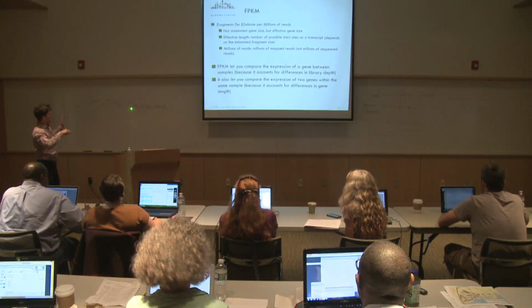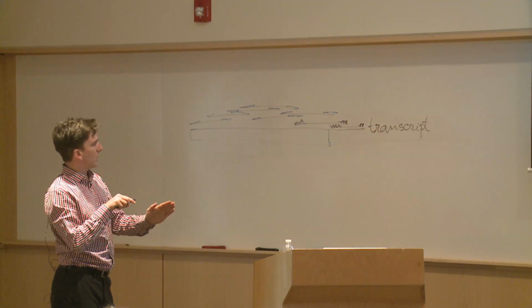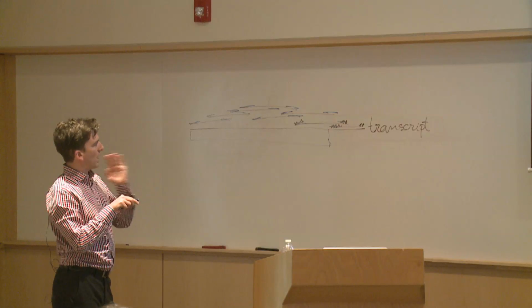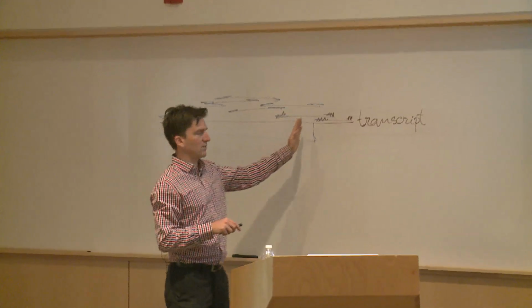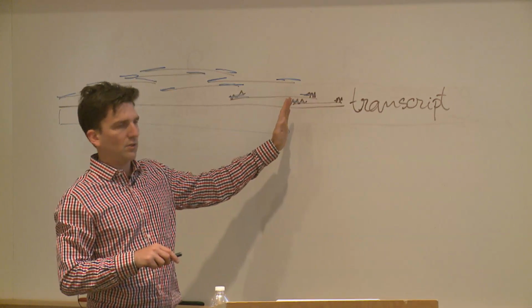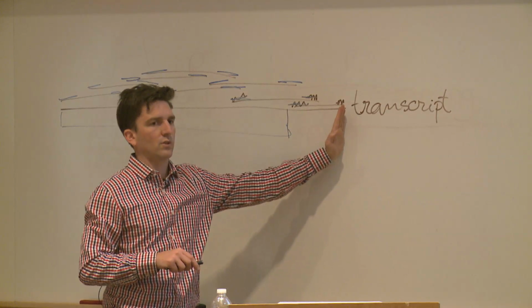Okay, and so here I describe the most 3' end fragment, which starts at that location. So that's the rightmost start position. That's the start position for a fragment that's the most on the 3' end. Okay? You can't have a fragment that starts here, because your transcript finishes here.